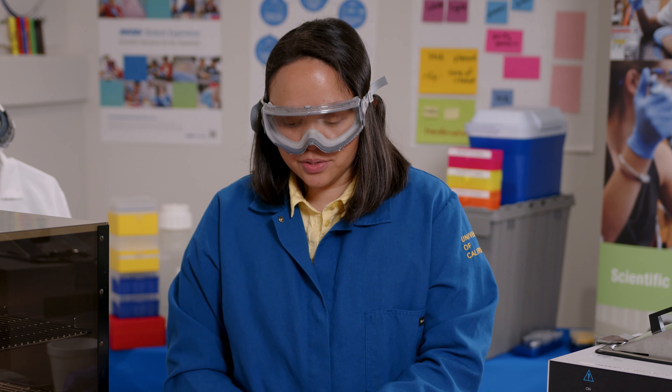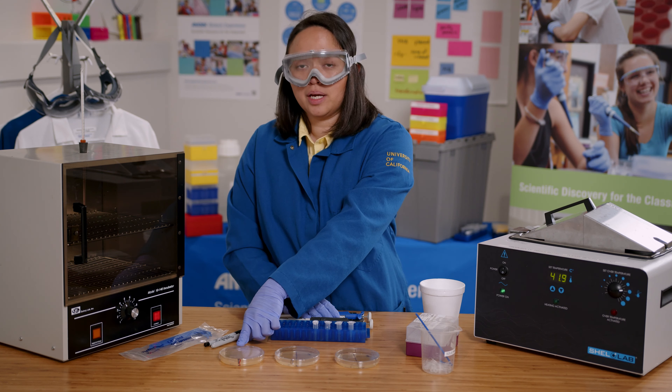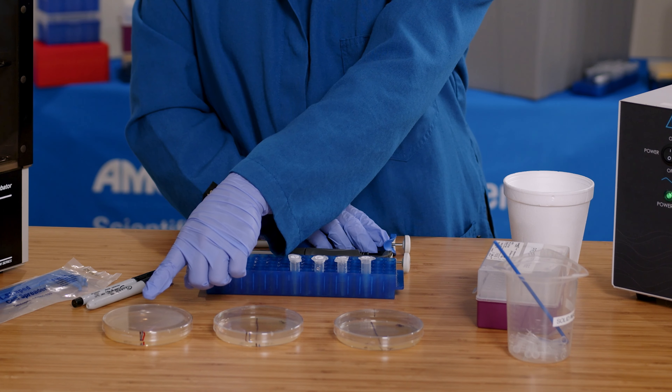I will do the same with the P+ tube, and I will also add 100 microliters onto the LB amp arabinose plate and spread it over the entire plate.